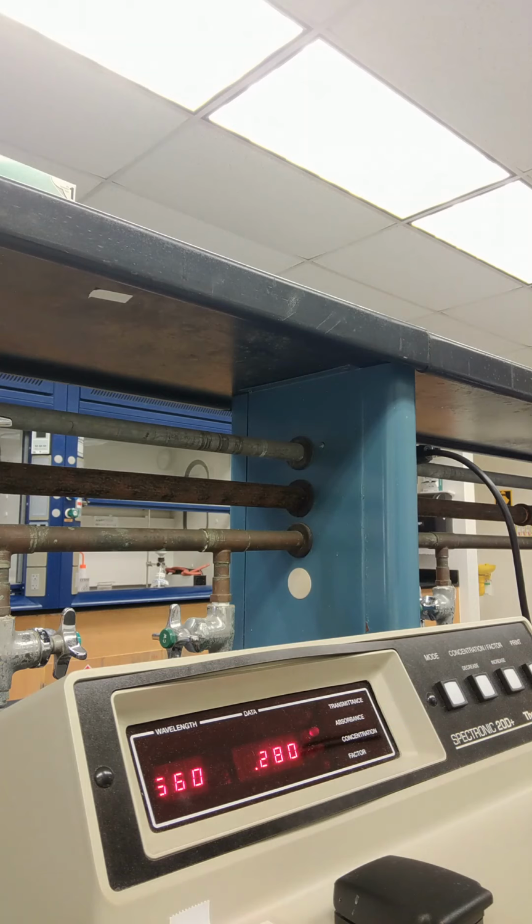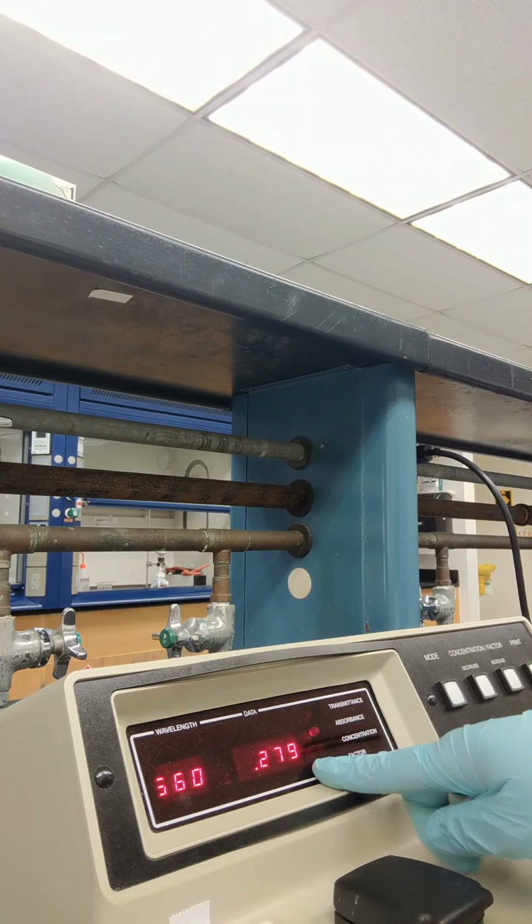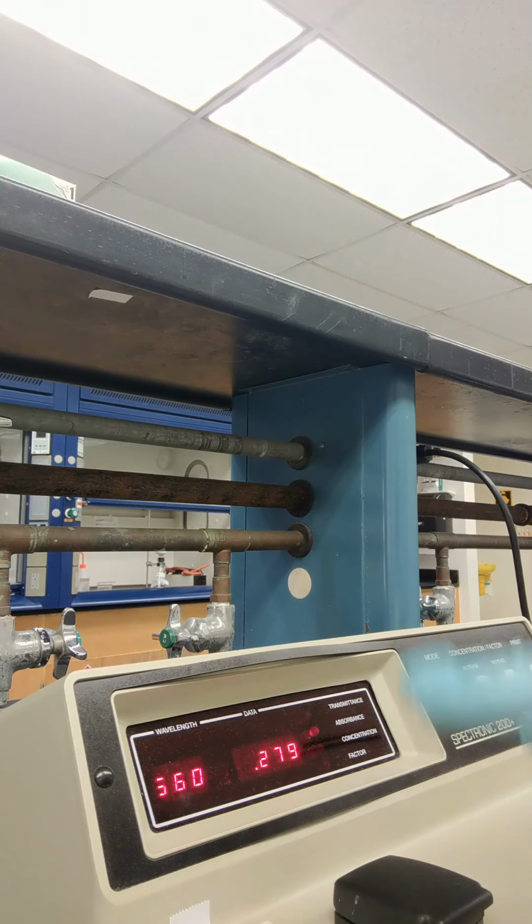We don't have to press anything. You have the sample, close the lid, and the number that you have here is the absorbance that corresponds to that first standard, standard A. Whenever you're doing your own experiment, you just need to copy the number that is in there. After you have that number, you remove the cuvette, transfer your solution back into the volumetric flask just in case, rinse the cuvette, and then move to the second standard, which is going to be standard B.